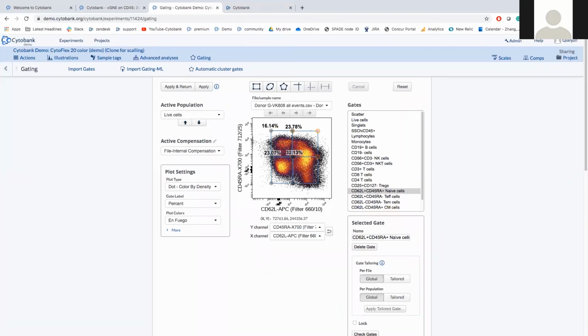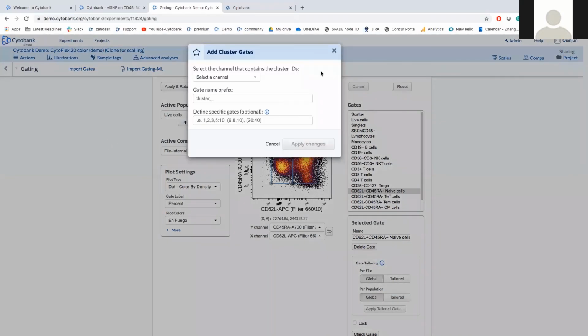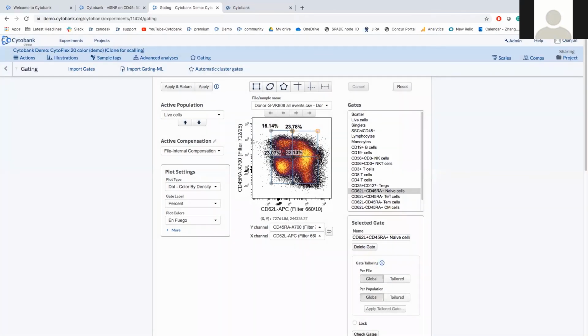After you've done a clustering analysis, which we will talk about in next Thursday's webinar, we'll talk about FlowSOM. What that does is automatically assign your cells to different clusters. A cluster is a group of cells that look similar to each other. The automatic cluster gating tool automatically puts all of the events that belong to the same cluster in a population. Using that tool will make those populations for you, so you can use them in your illustrations or in your statistical analysis or anything else afterwards. So you don't have to draw gates on those clusters. The tool does it for you.